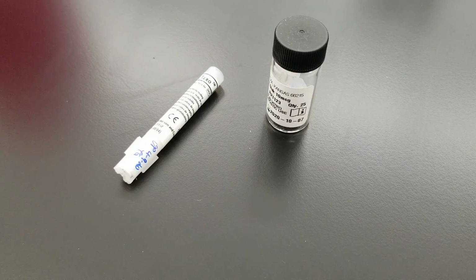There may be growth that doesn't match between the CO2 setup and the anaerobic setup. A lot of times when you have obligate anaerobes growing with facultative anaerobes, they look very similar. So this test is used in order to figure out who's who on the plate, basically.